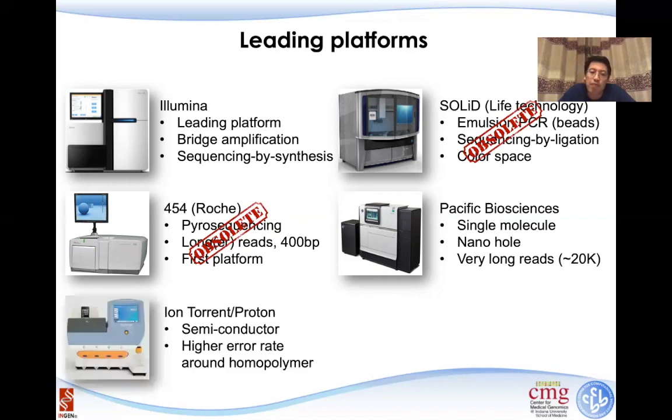Another one you read in the literature a lot is the Ion Torrent, Ion Proton technology. And actually we still have that machine in the Center for Medical Genomics here.